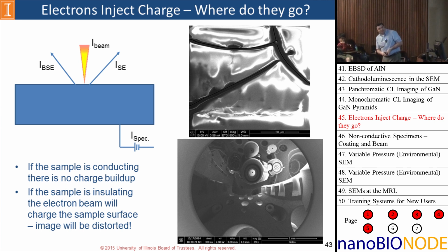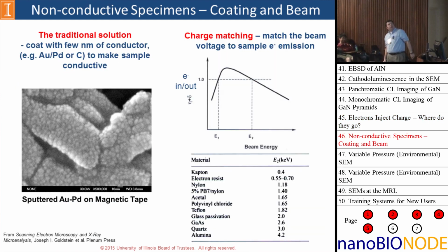So if we look at this image, we can pick out all the little individual parts. Here's the pole piece. Here's the Everhart-Thornley detector right there. I'm pretty sure that's the ion beam for the FIB, getting a little ahead of things. And I'm pretty sure that's the platinum needle. So yeah, this is always fun. You take a little bead, you charge it up, and then we do the reflection. And that lets you see what's going on at the top of your chamber, and sometimes that's useful.